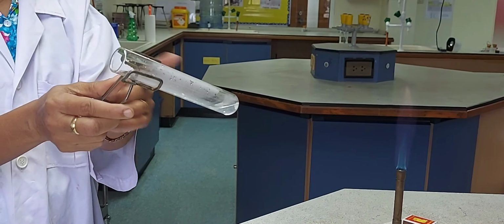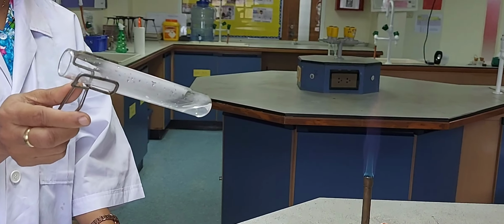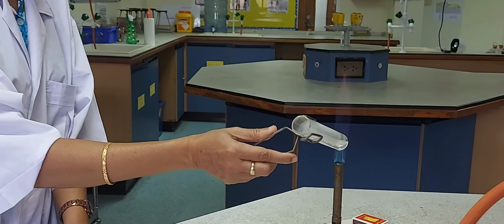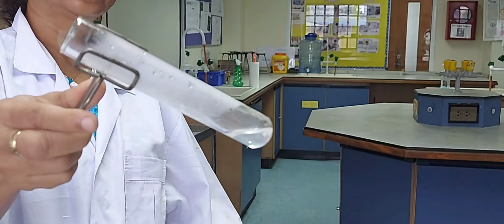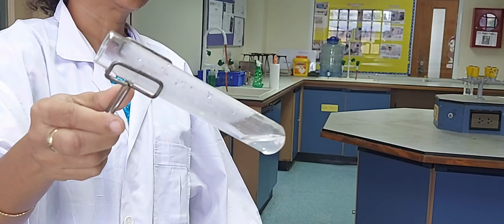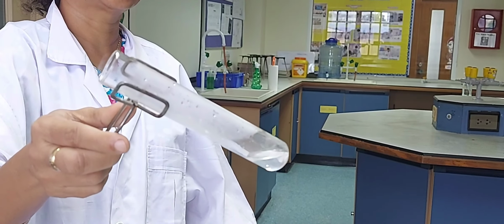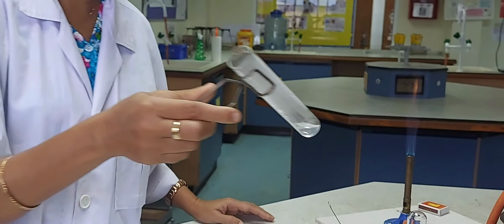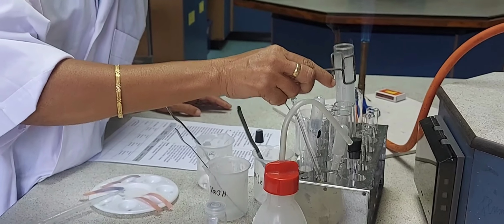So you can see the vapors on the sides of the test tube. So definitely it is water getting vaporized, and we get a solution mixture there which is cloudy. So barium hydroxide has reacted with HCl, giving barium chloride and water. So a neutralization reaction has happened.